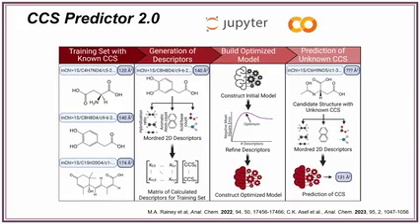You've got some kind of training set, and you are looking to identify which molecular descriptors are going to be the best to use for predicting the CCS values. And what's nice about their workflow is that, say you get a candidate structure from something else like MSMS, you can use that candidate structure to get the descriptors and come up with a predicted CCS value.